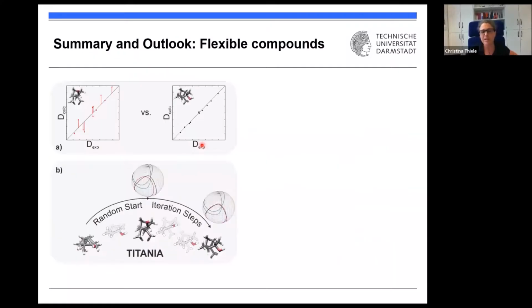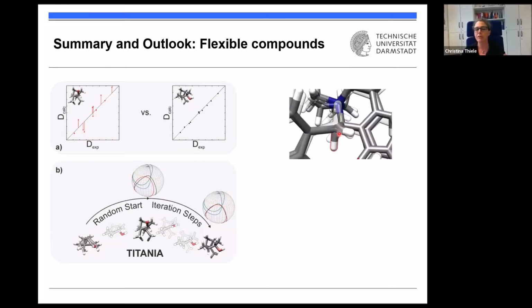So as time is passing on, and I do not want to take too much of your time, I'll stop at that point by saying, I think I've shown you that there is an alternative to this verification and falsification, that we can use this de novo approach to arrive at the correct relative configuration of organic compounds, even starting from random start structures. And the main issue was this inversion of stereogenic centers problem that was solved by redundant internal coordinates. Of course, this is not the end. This is just the start.